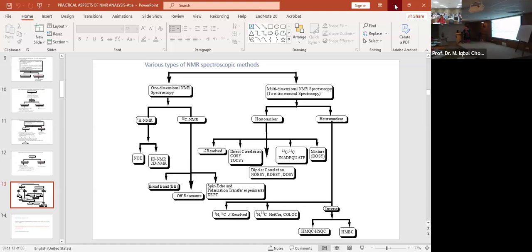Your sample will face the radio frequency. The radio frequency should hit the sample. And when you place your sample inside the probe, this much is the face of your NMR tube that is actually exposed to the radio frequency. So that much, simple.